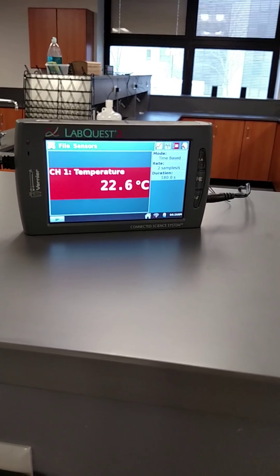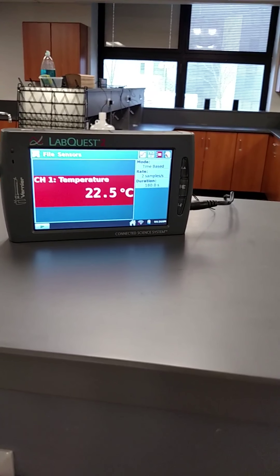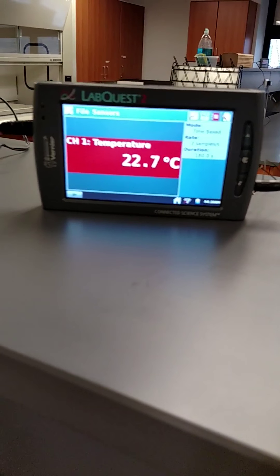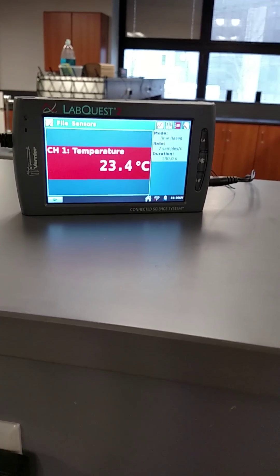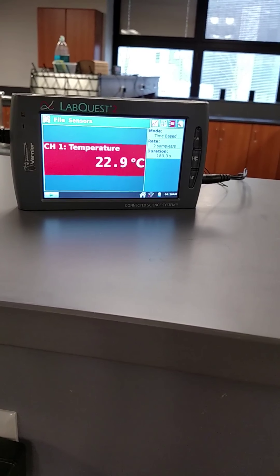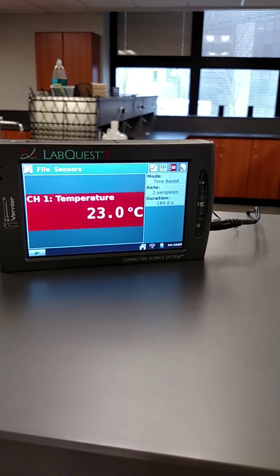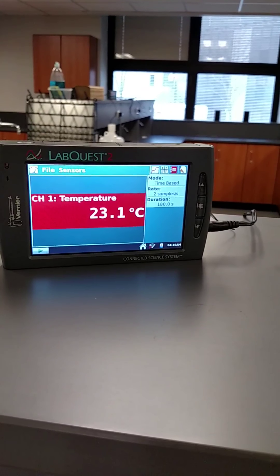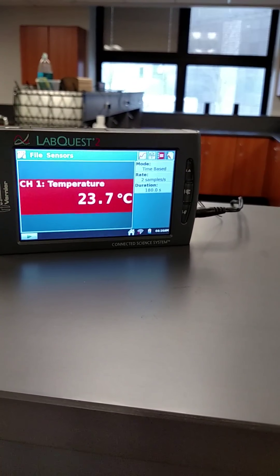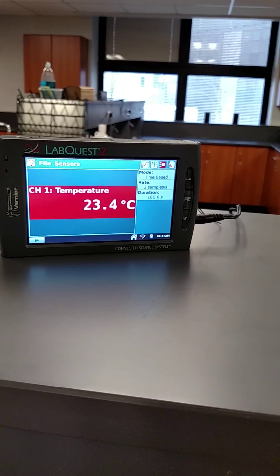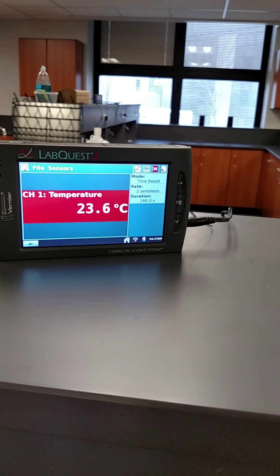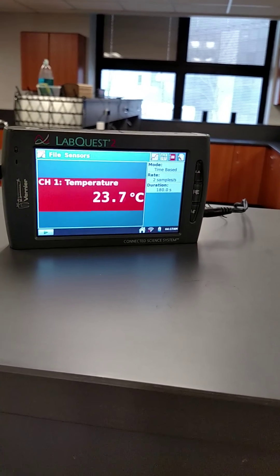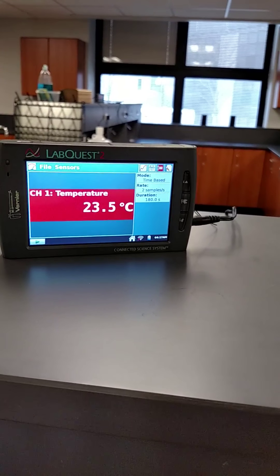I'm just stirring it a little. Looks like that highest read, it's still going up. Good, still going up.